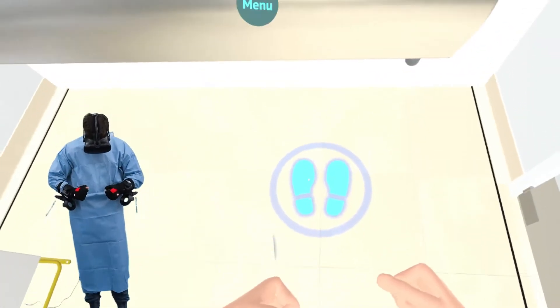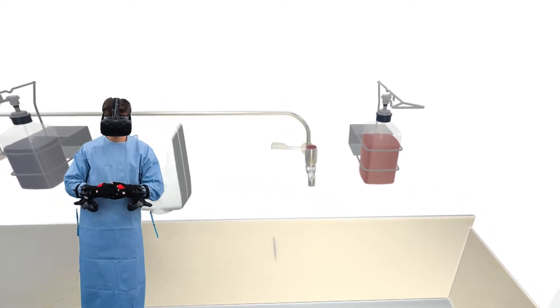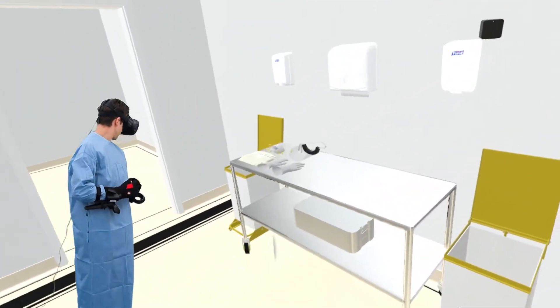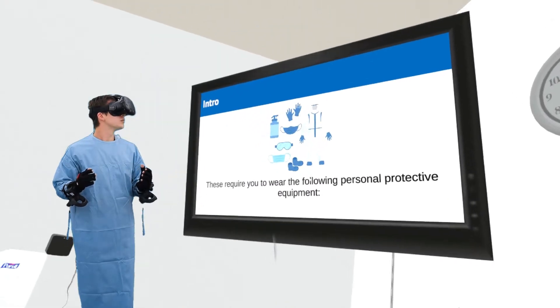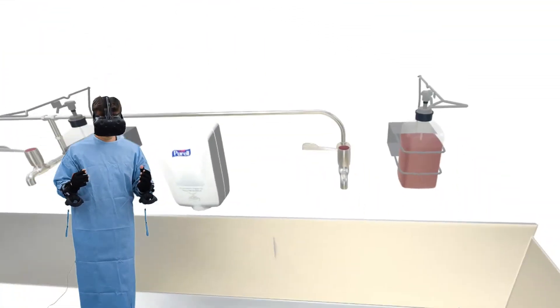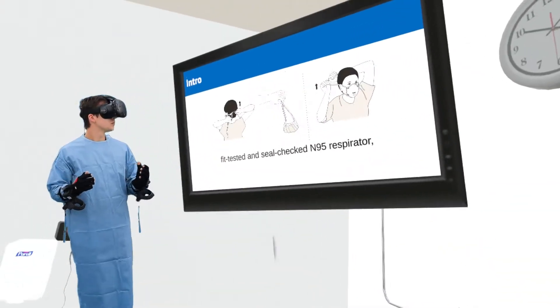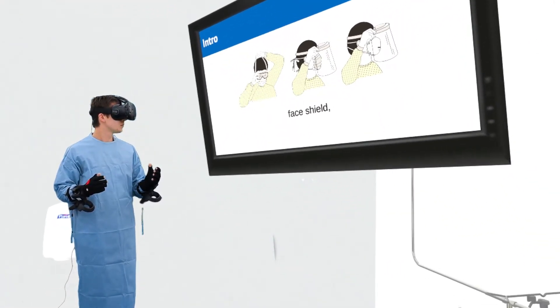For novel pathogens such as novel coronavirus, MERS-CoV, or avian influenza, the recommended additional precautions are airborne, droplet, and contact precautions. These require you to wear the following personal protective equipment: gown, fit-tested and seal-checked N95 respirator, face shield, and gloves.